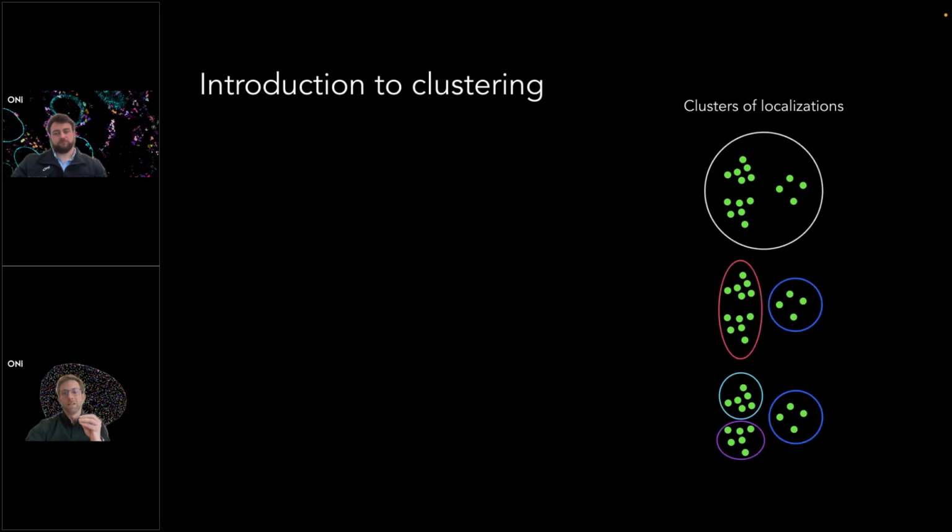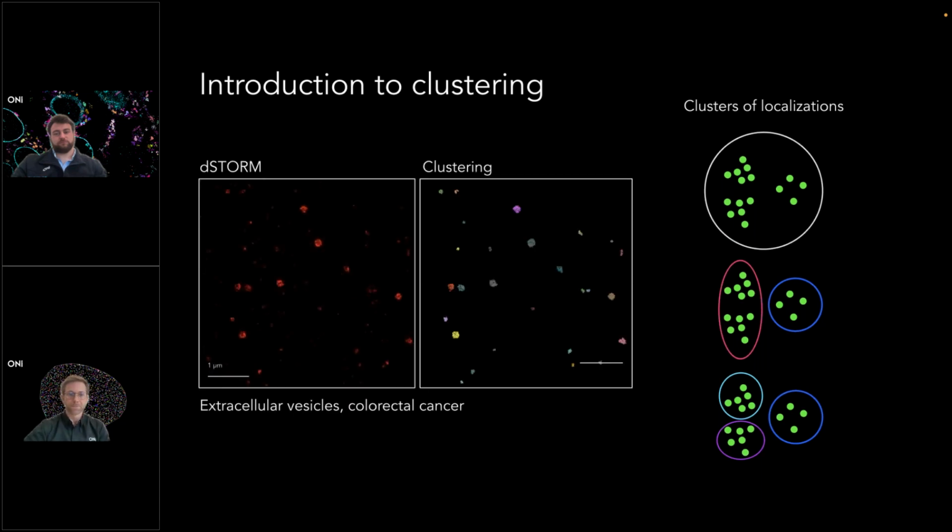This idea of clustering in super resolution is really important because it helps us identify if there's potentially a single fluorophore stuck to the cover slip that we're not interested in looking at, or if we're looking at larger clusters with more localizations that are probably more relevant for the specific receptors, or the different clusters of receptors, that we're trying to look at.